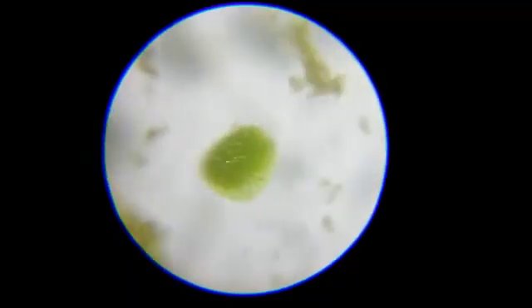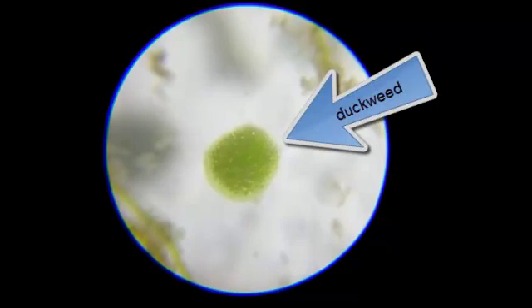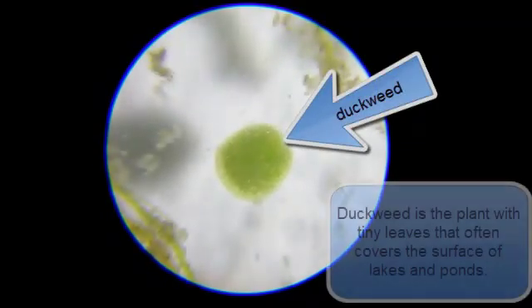Now, that big green mass, that is a piece of duckweed. And that's multicellular. You can almost make out the cells in that.